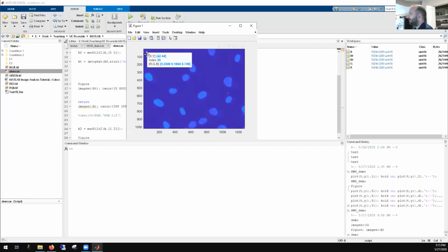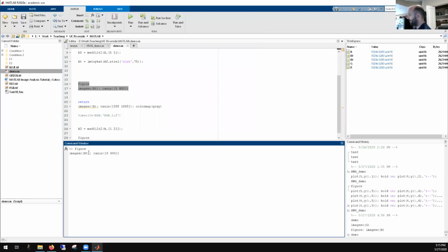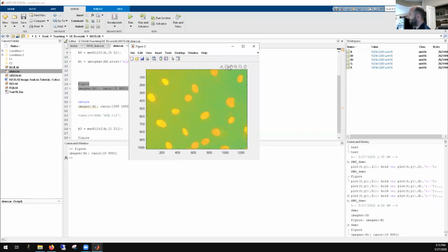And up here in our originally bright corner, it's a little bit brighter than down here still, although it's much, much flatter. But we have 20, 21, 22, mid-20s. Let me throw up the original image just for fun and take a look at that same thing. So we have this nuclei that's kind of dim. We're in the 700s, 600s, and so on. If I go up in this corner, 500, there's a 600 in there as well.